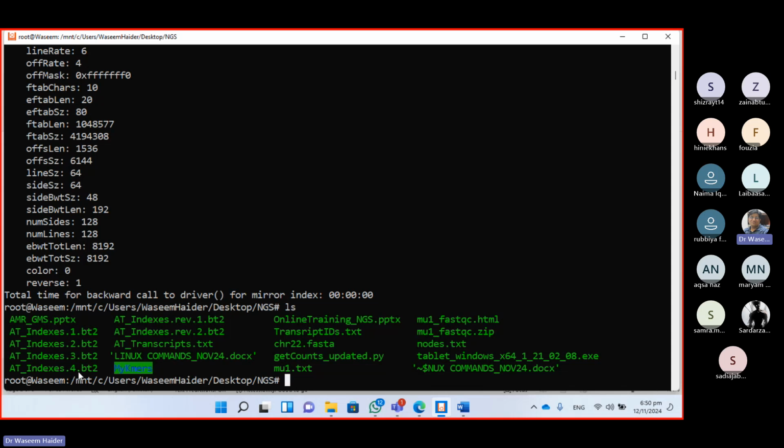So it takes the original sequences, those FASTA sequences, and then tries to find out the common sequences amongst them. Those are the ones which look similar. The original reference is then broken into short fragments or sequences, right?